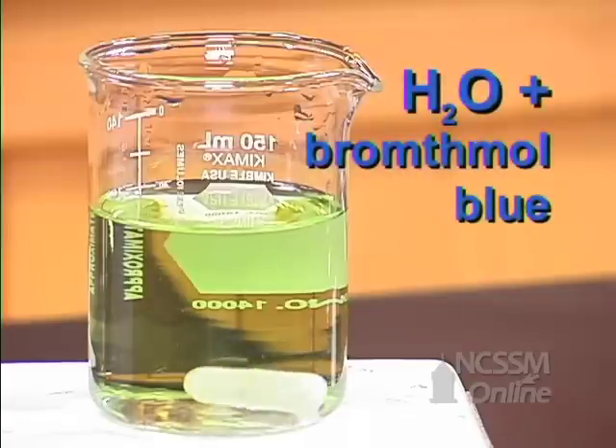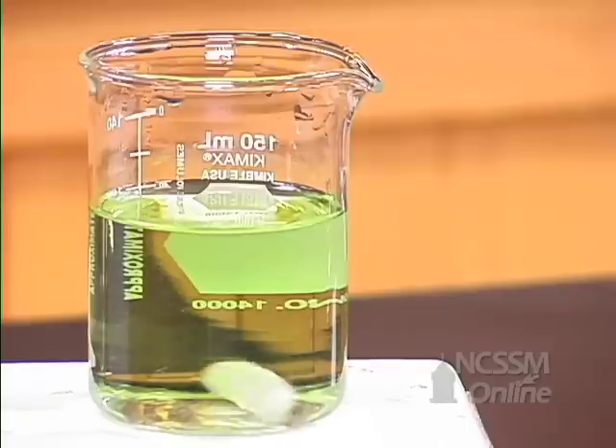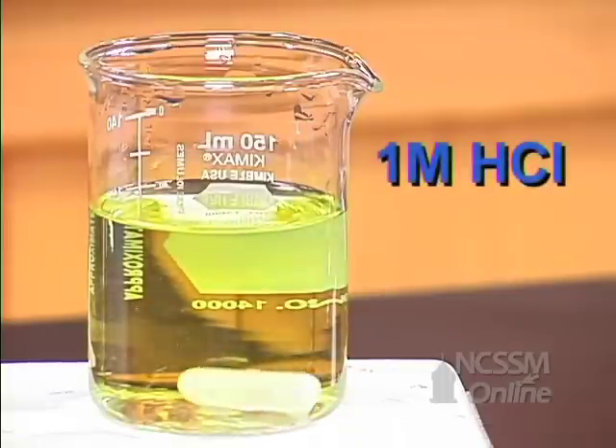We have some distilled water, and we've added a little bit of bromothymol blue to it. Bromothymol blue is blue in basic solution, yellow in acidic solution, and green in neutral solution. I'm going to add some one molar HCl to the solution.